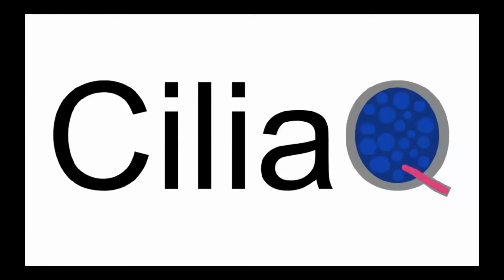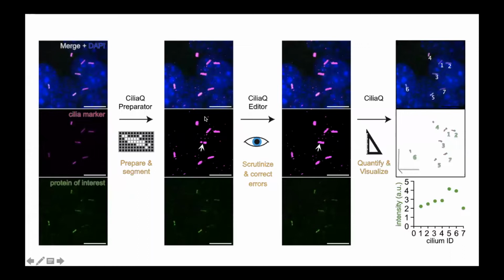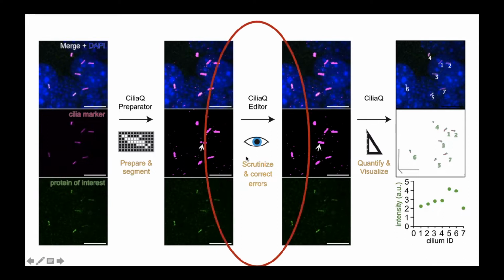Hello friends, and welcome back to the tutorials on CiliaQ. Well, you remember that we have three different plugins in our CiliaQ package. And last time we talked about CiliaQ Preparator, and it is time to go through CiliaQ Editor together.